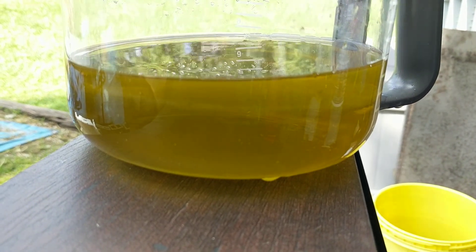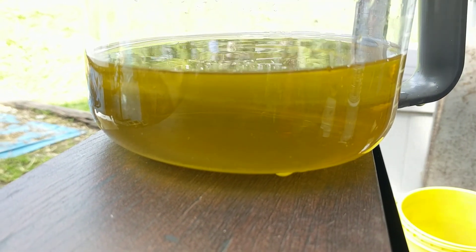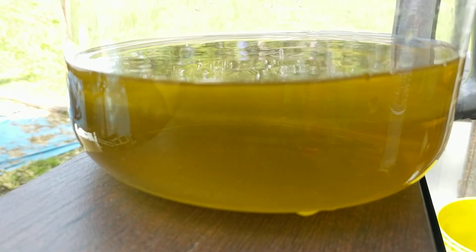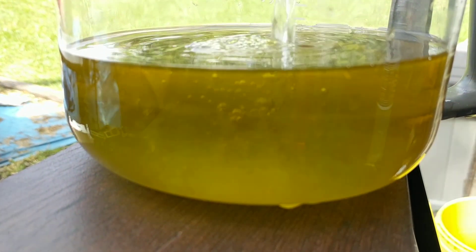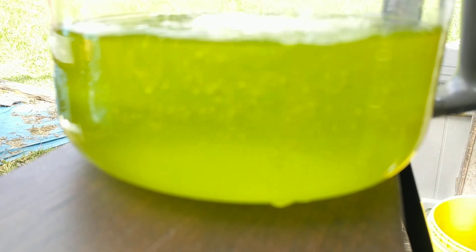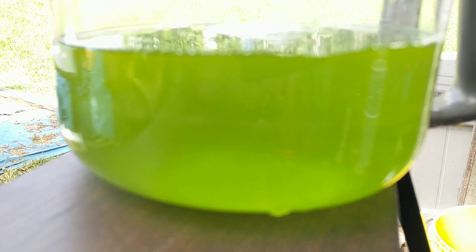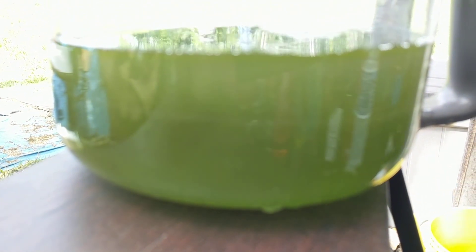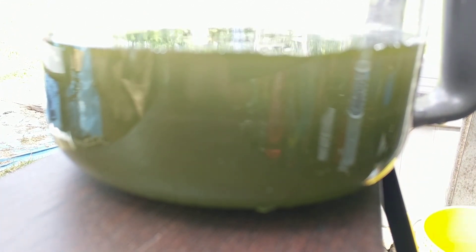All right guys, I promised you a drop and I want to get this done. So Joe's gonna pour it in now. Here we go. Now that's the kind of drop I remember. Just like that. Pretty, pretty, pretty.